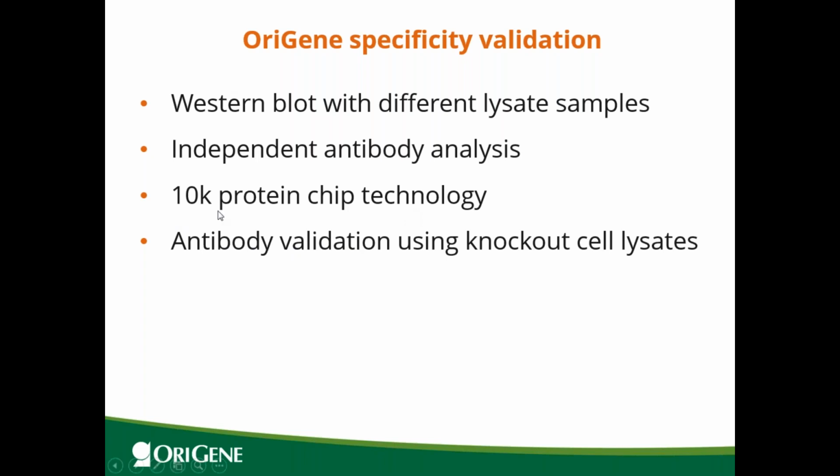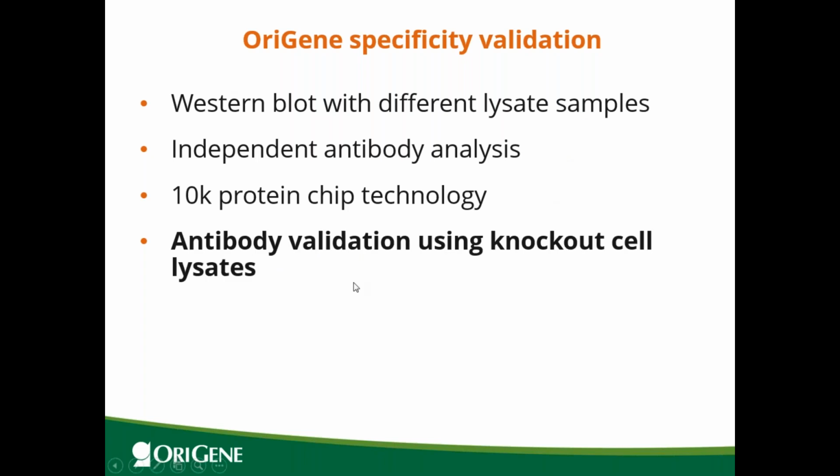The last method, which is going to be the focus for today's talk, is the validation using a knockout cell lysate. So I'll go through each of these methods with some real experimental data and focus on the last method for the second part of my presentation.